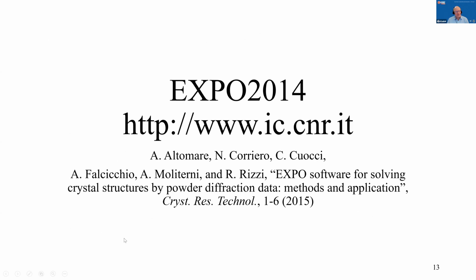So direct methods. One can use single crystal direct methods by essentially creating a small, kind of crummy pseudo single crystal data set from your powder data. I find it more efficient to use a program designed to do this. I tend to use EXPO 2014 from the group in Bari. I mentioned the XLens program from Jordi Rius, which will also work well. These are designed to work with powder data to overcome some of the limitations of overlap and limited data, and can work reasonably well.